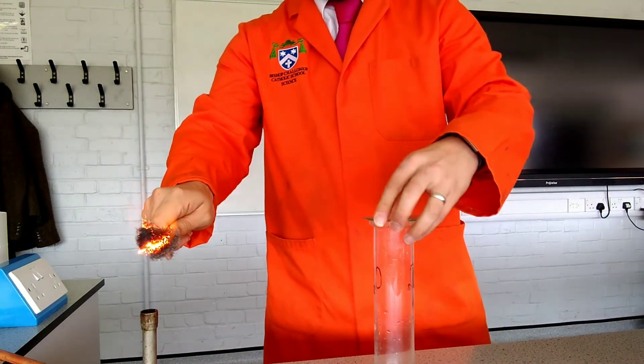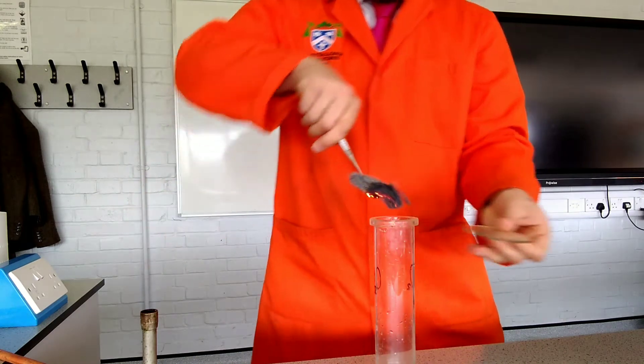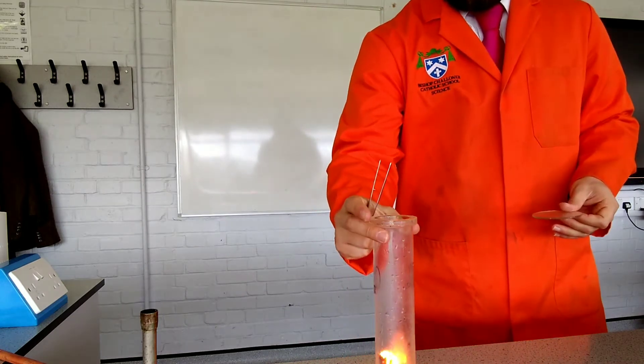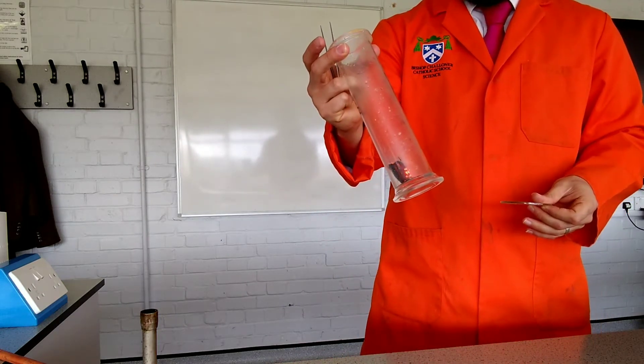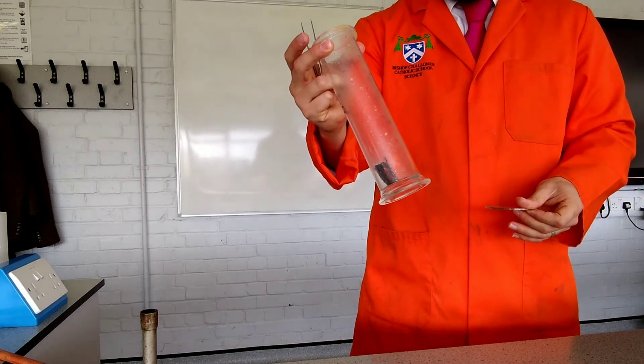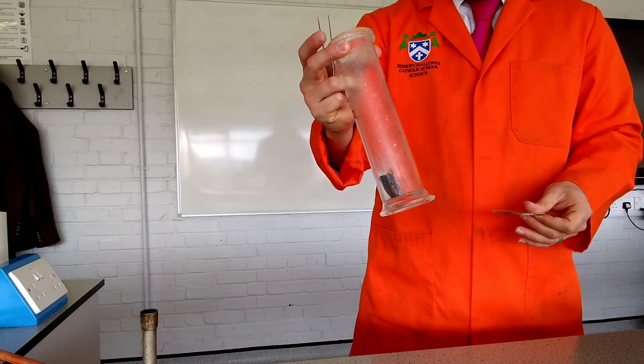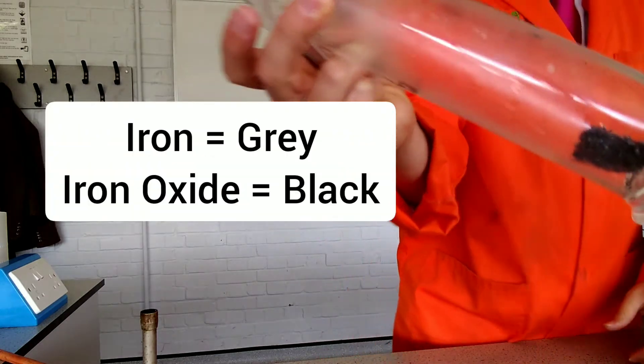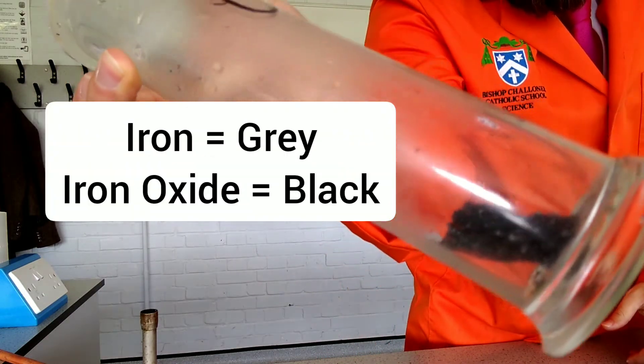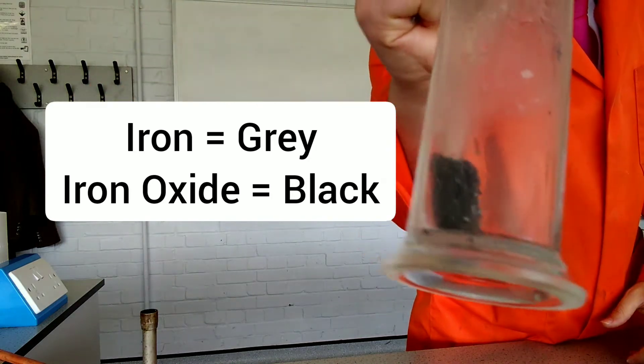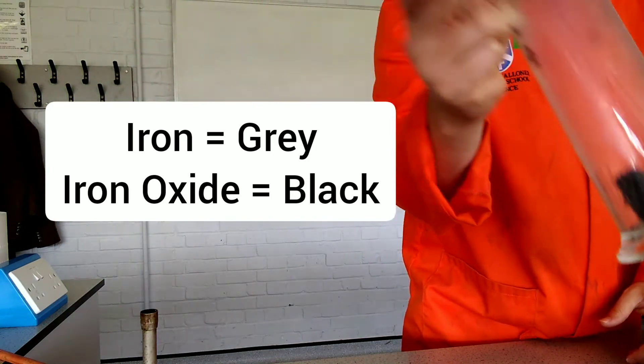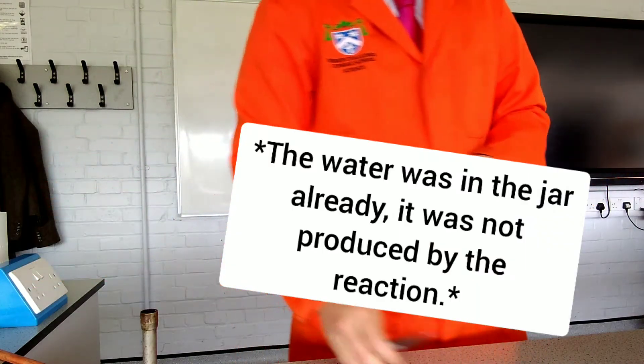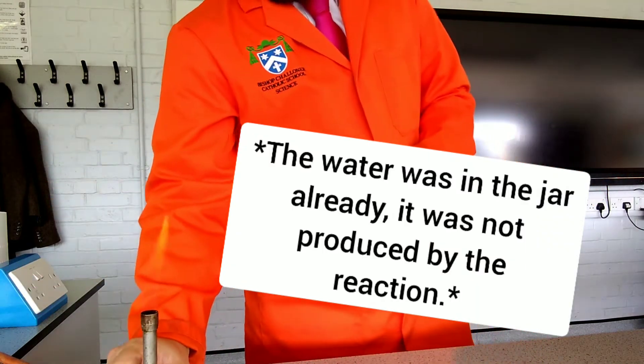So you'll notice that this one actually does burn in oxygen and in the air. And as I place it into the gas jar, hopefully you can see it burns really, really, quite quickly. And that is because of the large surface area. So that was iron wool. You can see now it's already formed that black iron oxide all over it there.